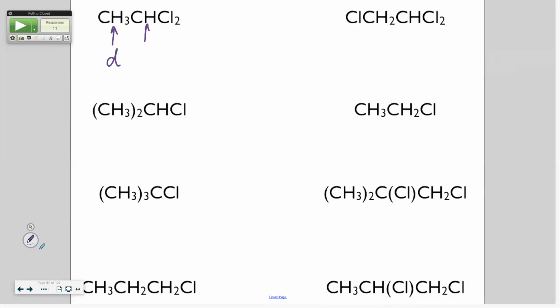Okay, so are they those little peaks that you were talking about? The spinning sideband? No, no, these are a whole other realm of peaks that we haven't seen yet. So what is the next NMR that you have on your sheet? Like if you look at your slides.